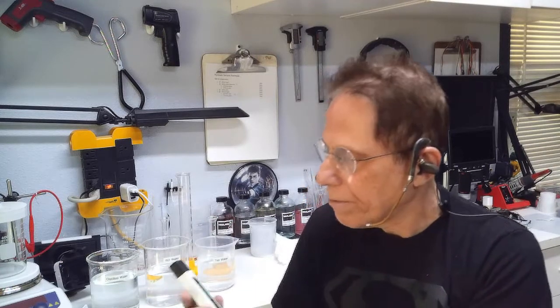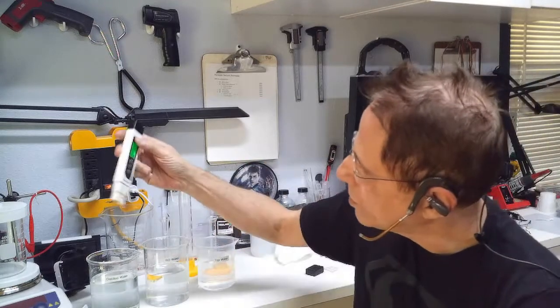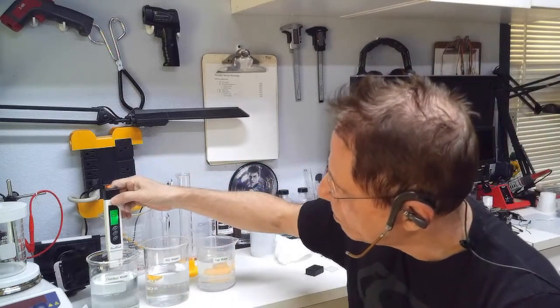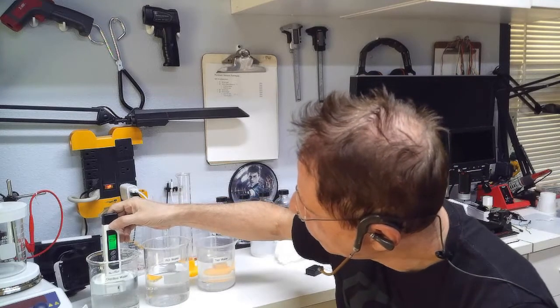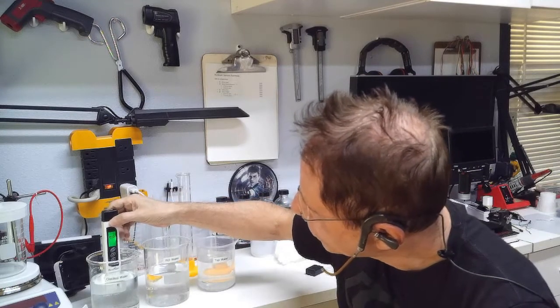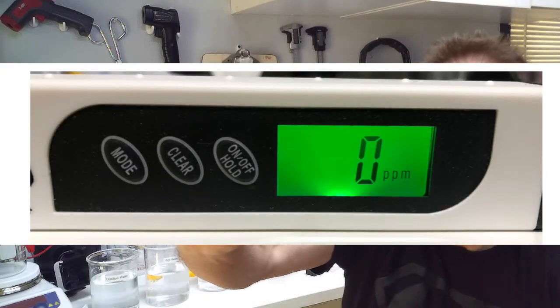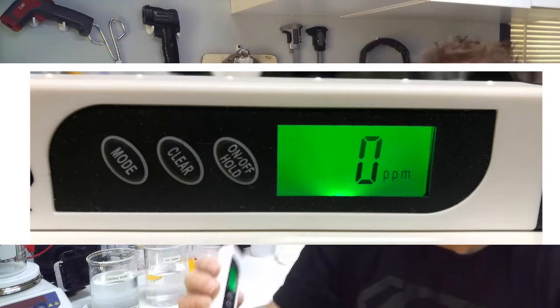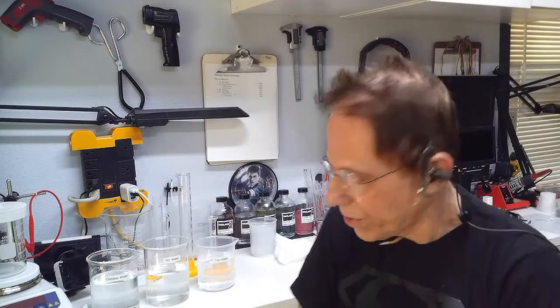So if we're going to start off at 0 parts per million, right? We're going to go into the distilled water, and I'm going to place it in here and let it sit for a few seconds. And as you can see, it's 0 parts per million. That's good distilled water. Should always be 0 parts per million. Should be nothing in it.